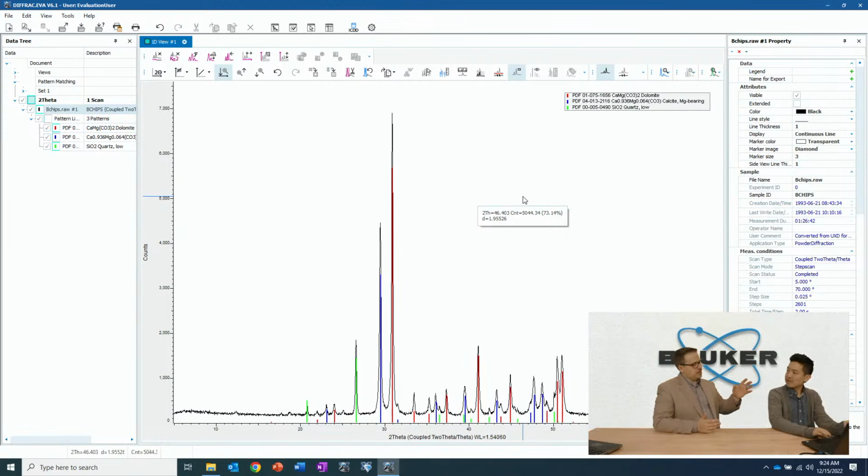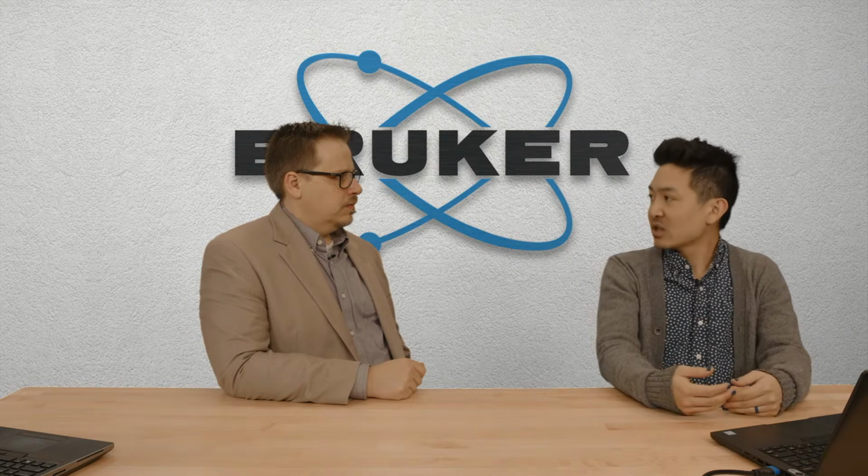I mean, there was a little bit of choice you could make. But if you went back and looked at it, you would see 4 or 5 different calcites. There's like 8 different dolomites, and so that may be slightly different depending on the region where you got that from, the local chemistry. And these are naturally occurring, right? They're not necessarily synthetic. It wasn't necessarily a perfect single crystal. So there might be some variation there as well.